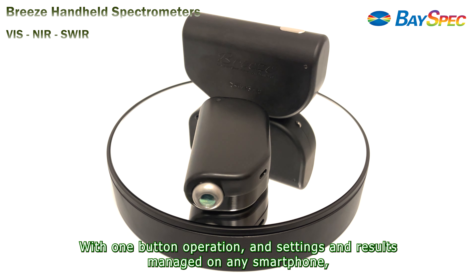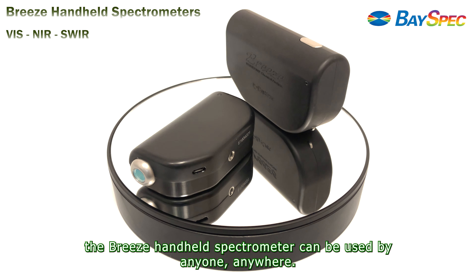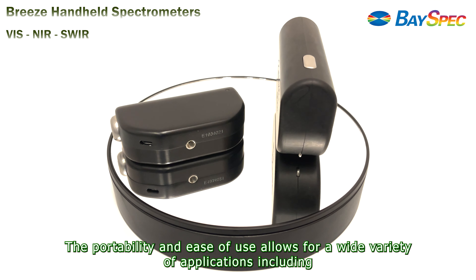With one button operation and settings and results managed on any smartphone, the Breeze handheld spectrometer can be used by anyone, anywhere. The portability and ease of use allows for a wide variety of applications.